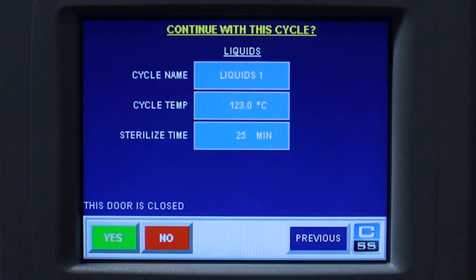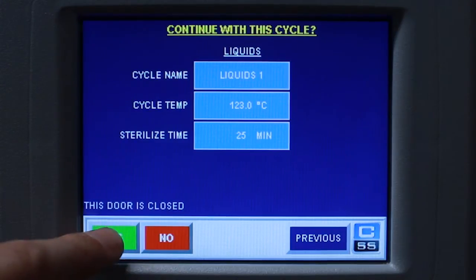Once you have verified the cycle parameters and the door is closed, press yes and your cycle will start.